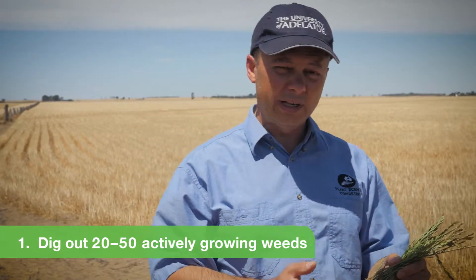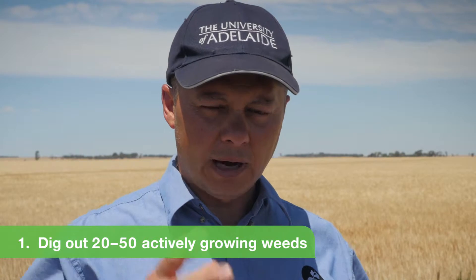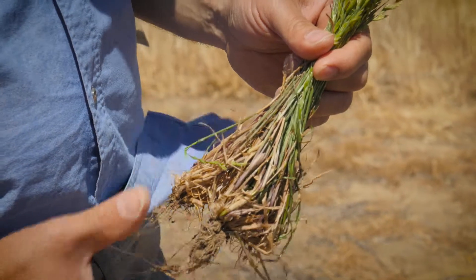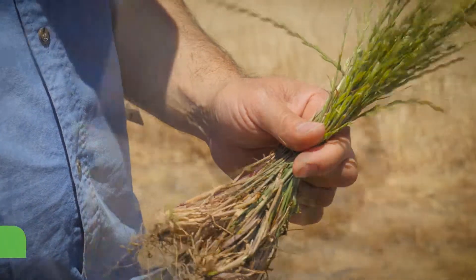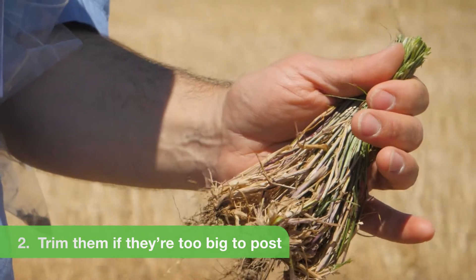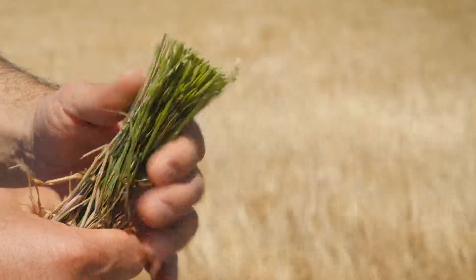From your side, all we need is to pull out about 20 to 50 plants. What we do is we can split the tillers and plant them into different pots and spray them with different herbicides. This sample is suitable for a quick test. If these plants were very tall — like wild oats really tall — what you could do is just chop the tops off, leaving about 10 centimeters of plant material, and send that through. That just makes postage easier.